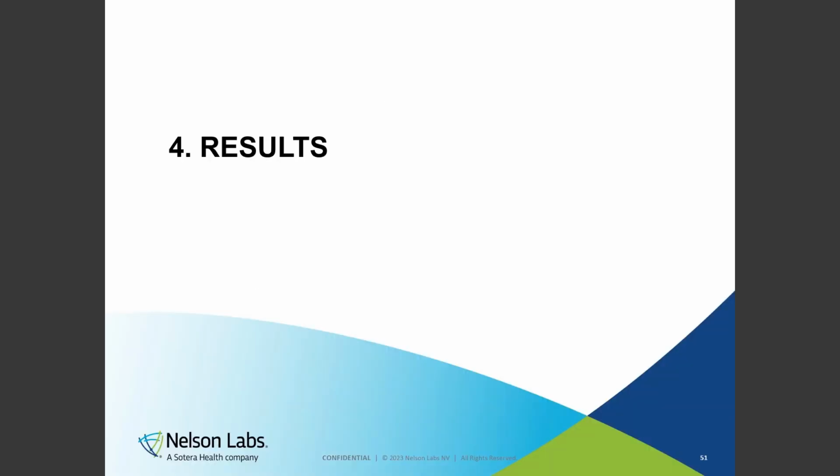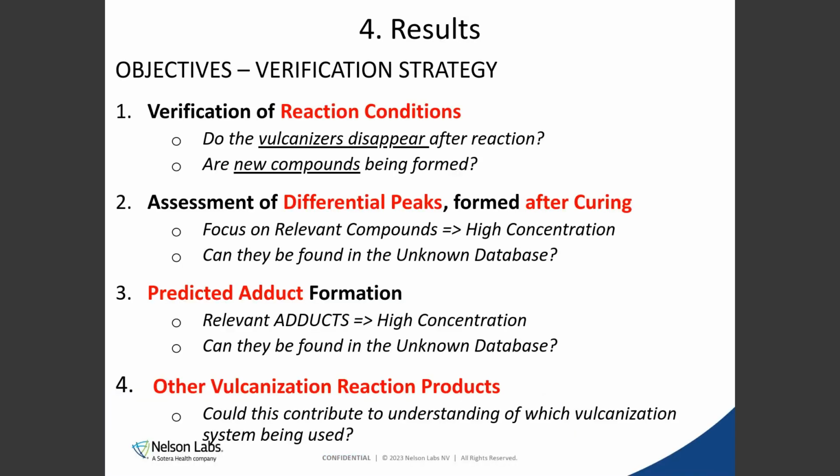Anyway, the first step was coming to the results already. First, what we want to see is, are the reaction conditions okay? Do the vulcanizers disappear after the reaction? Are new compounds being formed? Meaning, are the reaction conditions okay?